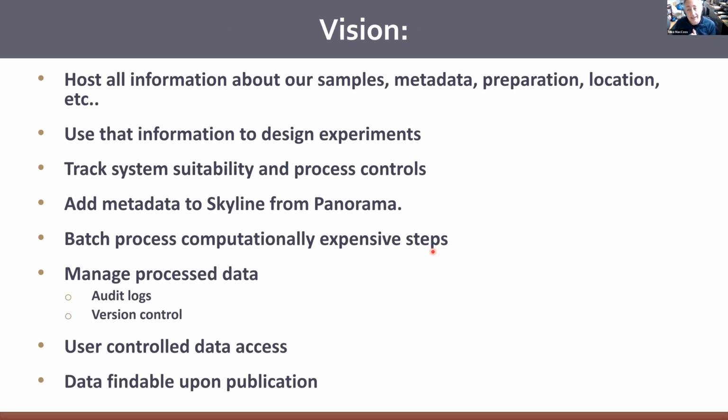Okay, so a little bit about this ultimate vision: we'd love to be able to host all the information about our samples, metadata, preparation, location, et cetera, in one server. We're completely all in on using LabKey Server. We have this Panorama module for storing and managing targeted proteomics data, and it's been extended to all mass spectrometry data that's been analyzed with Skyline. We use that information to ultimately design experiments, to track system suitability and process controls, like I mentioned with you, and to add metadata to Skyline that's stored potentially within the Sample Manager. So that's not correct on the slide: it should be the Sample Manager, not the Panorama module.